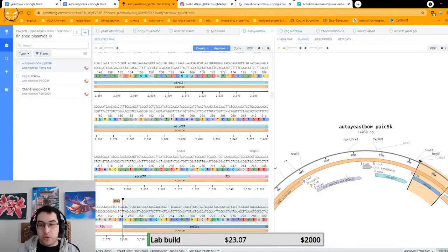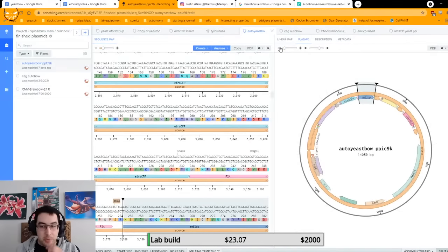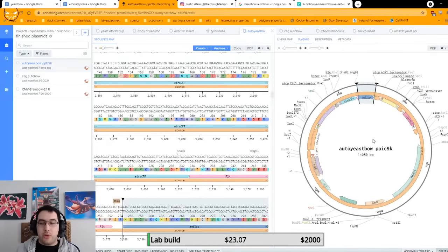And the reason this is really cool is because the way that this particular plasmid works is it's an integrating plasmid, and more than one copy can integrate. So what this means is that not only would I get to teach Cre recombination, inducible and constitutive promoters, multiple reporters, I could also teach transformation and integrative transformation. This is crazy for the amount of genetic engineering that you can cram into one thing. So I think this is going to be amazing. Now, the cherry on the top.